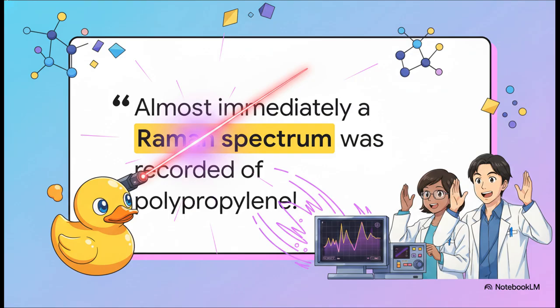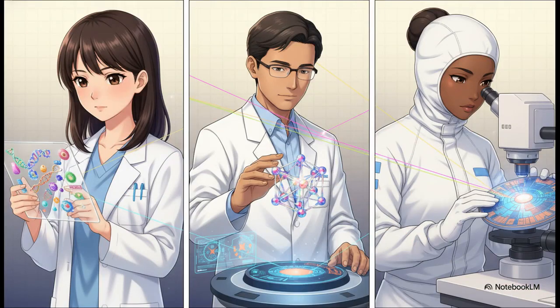This fantastic little anecdote perfectly highlights the ultimate superpower of Raman spectroscopy. It requires almost zero sample preparation, and it completely doesn't destroy the object you are testing. You don't need to dissolve, slice, or chemically alter your sample at all. You just literally shine a light on it. Because it is so versatile and non-destructive, scientists are using this exact method for some truly mind-blowing things across multiple industries.